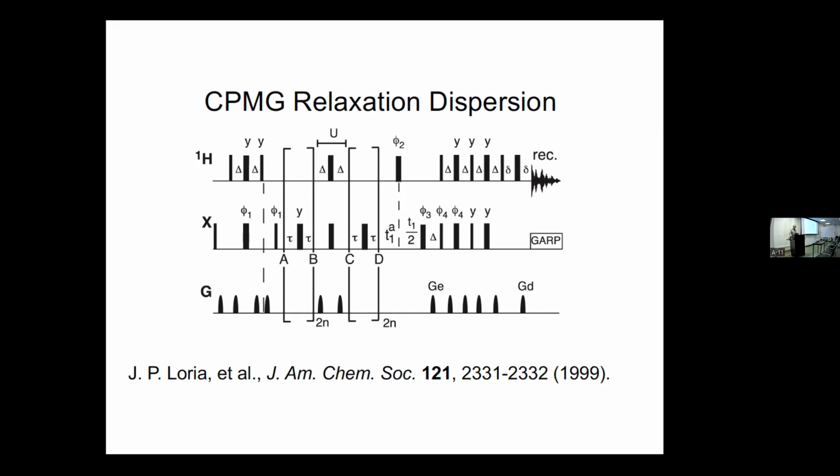These days, there are sequences where you turn on a very strong CW field, and that has to be very carefully calibrated depending on the delays and the J couplings. So it saves this relaxation delay, but adds a little bit of complexity. Yeah, so it's kind of historical.